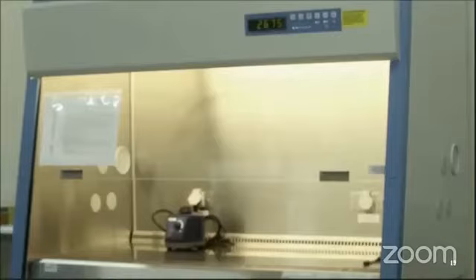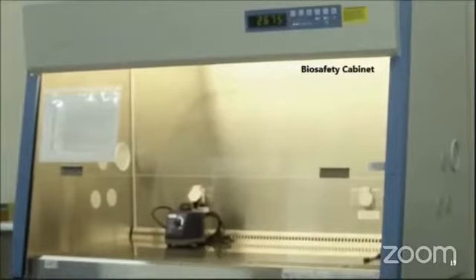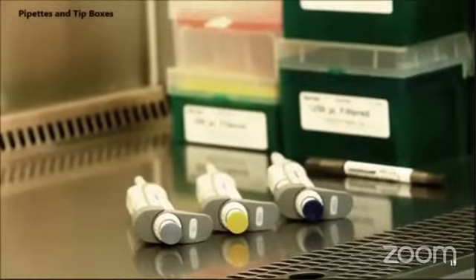The necessary equipment for RNA extraction includes Class 2 biosafety cabinets, dedicated pipettes, and tip boxes.